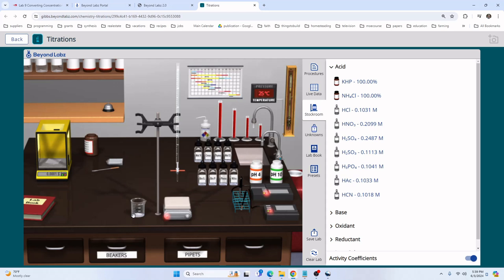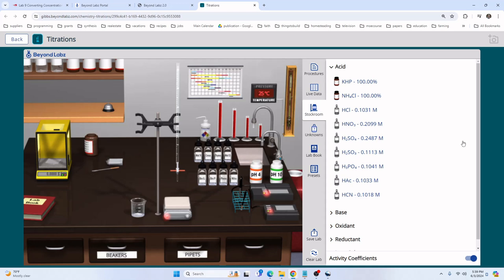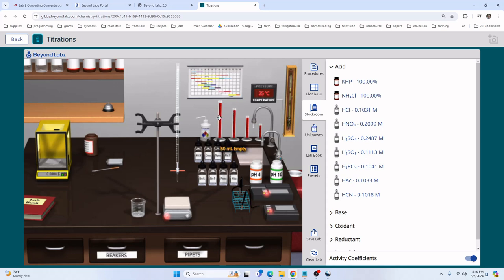Let's go ahead and pull our beaker over to the highlighted region. Next we're going to add 25 milliliters of water with a 25 milliliter graduated cylinder. Pull it under the sink and it'll snap back when it's full. Now let's drag it to the beaker. Next we're going to add this to the 50 milliliter graduated cylinder. Normally you would use a volumetric flask for this, but we're using the graduated cylinder here because this simulation doesn't have volumetric flasks.